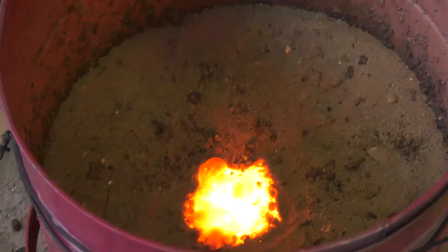On the ground of the pot you can see the outflowing glowing hot thermite which has reacted to form raw iron.